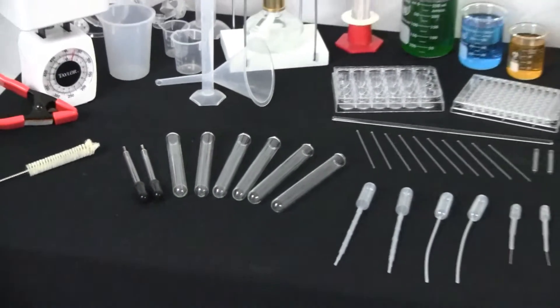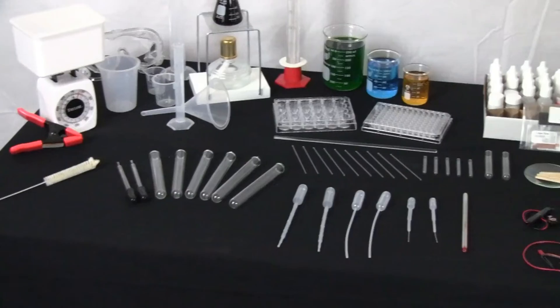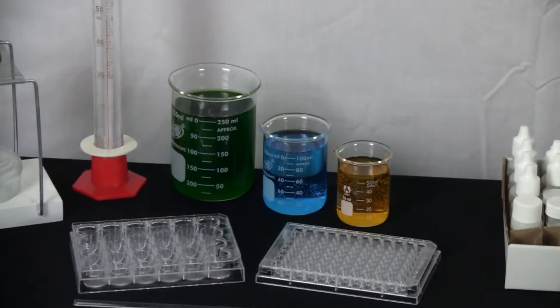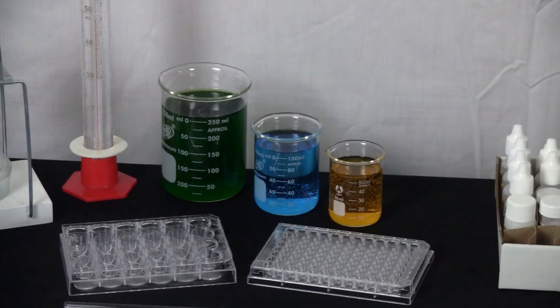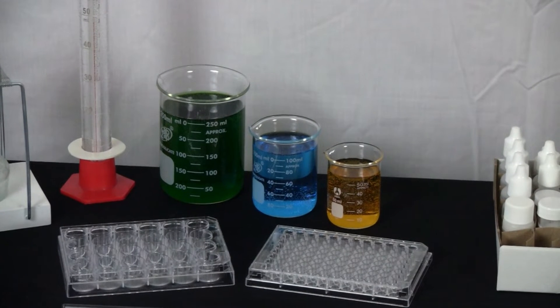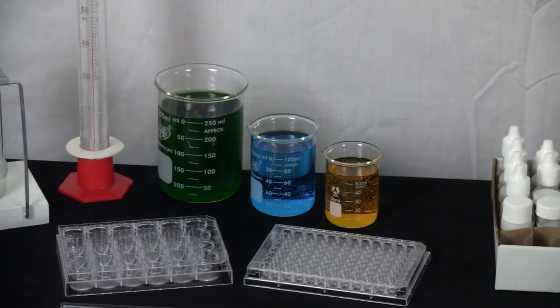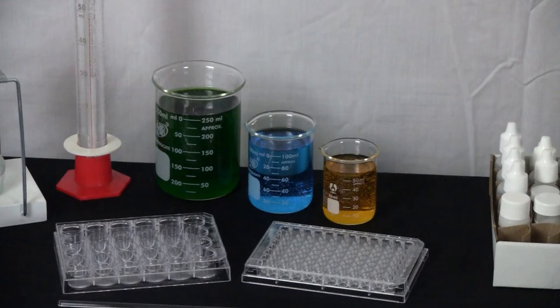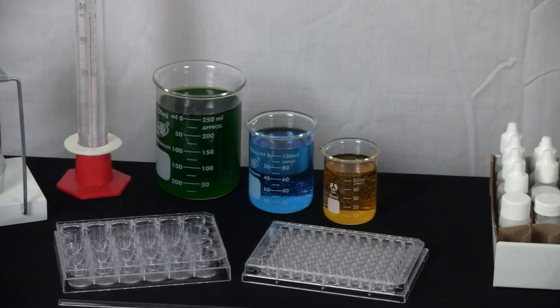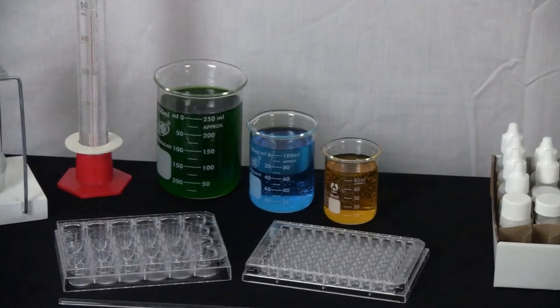The next thing we have is beakers over here. These beakers are measuring devices that are similar to drinking glasses. They can be heated also, and they allow you to be able to measure different liquids, and they also have a spout for pouring, if you can see the spout on each of those beakers.